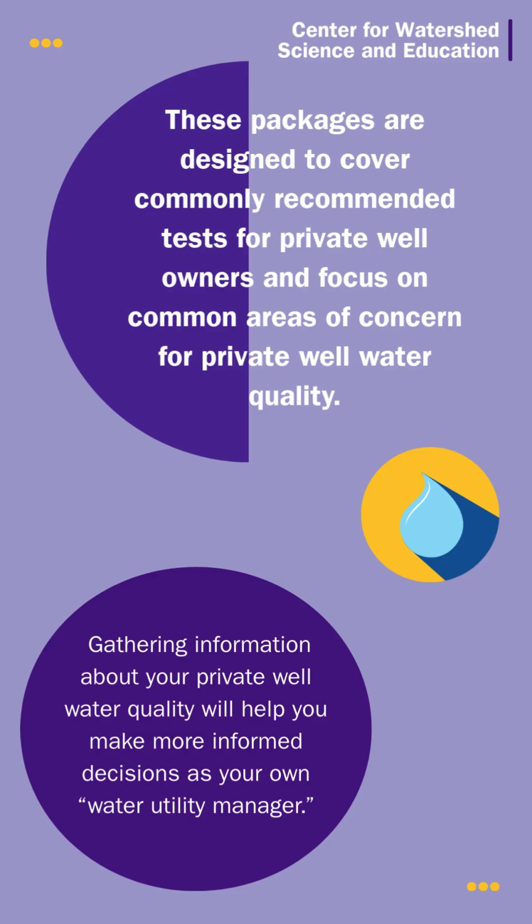Some of the tests, such as bacteria, nitrate, arsenic, and lead, are important to human health, while others may help diagnose taste, color, or odor issues with your water. Gathering information about your private well water quality will help you make more informed decisions as your own water utility manager. Watch the video all the way through before conducting your sampling to ensure you are doing so correctly.